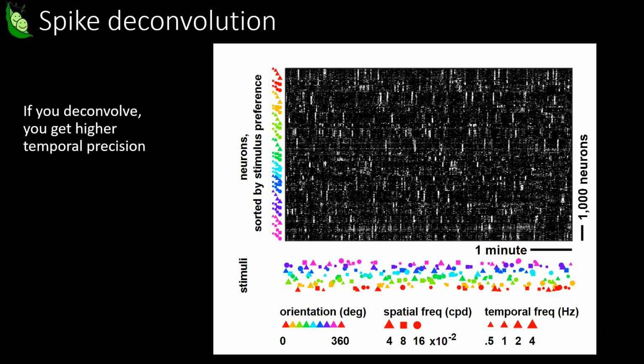You could even test and see, for instance, let's say you binarize your signal, how much information you lose in terms of what you're trying to decode or something like that. Yeah, no, sorry. I'm asking because we're trying to deconvolve some single spine signals and then correlate it to spike sorted data from combined extracellular recordings, right? So that would be a way to say, okay, this spine is from this neuron. That's why we need spike times, or we need to convolve the spike train to get some sort of calcium trace. But I guess it's the same problem.